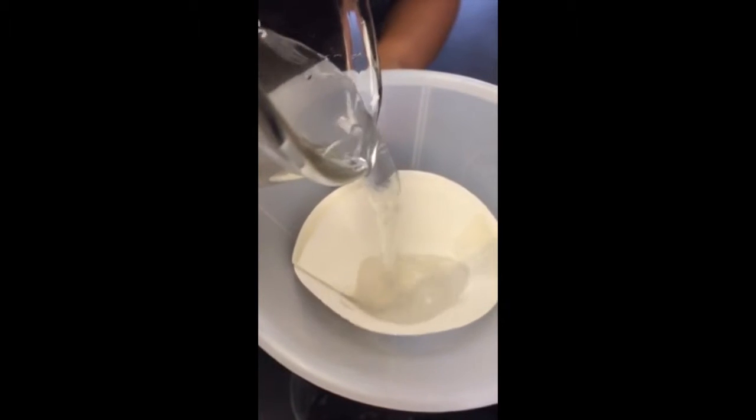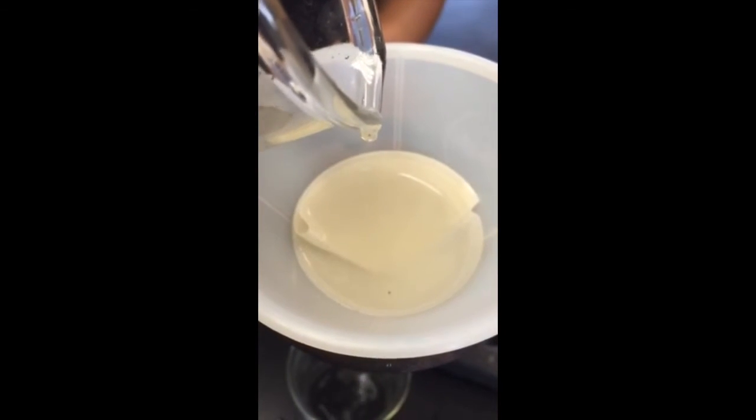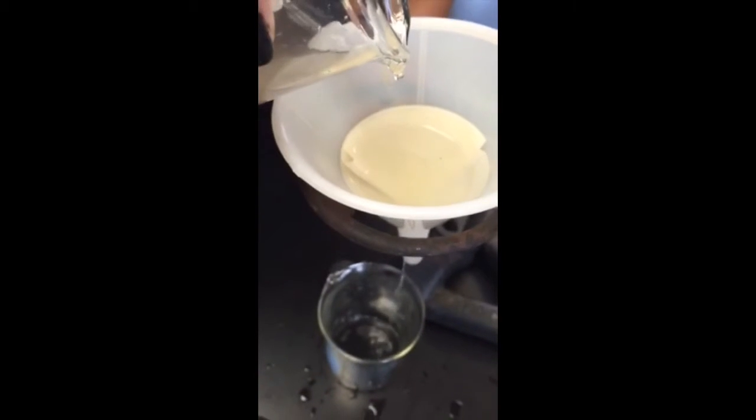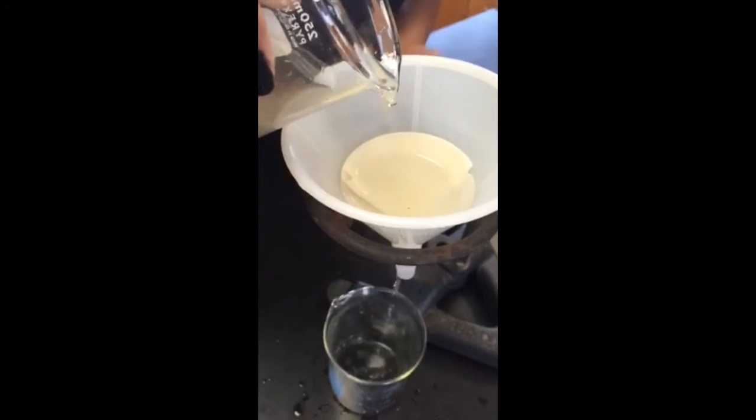I am slowly pouring my mixture into the filter paper. As you can see, only the water is dripping into the beaker and the sand is going to catch inside the paper.